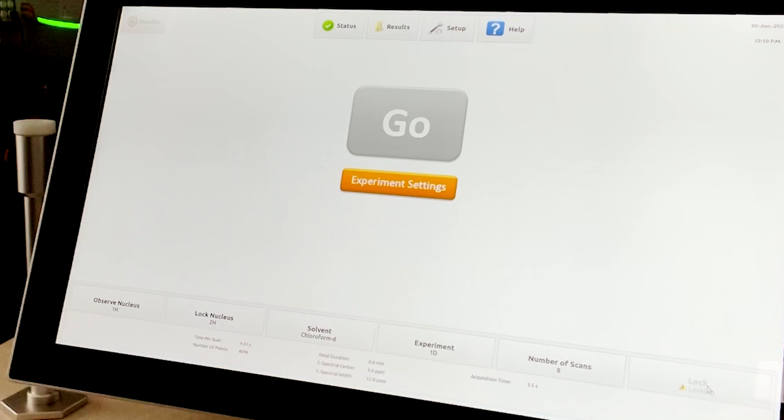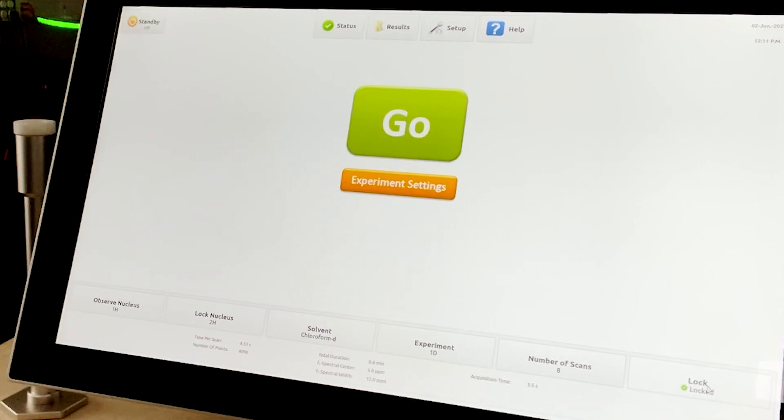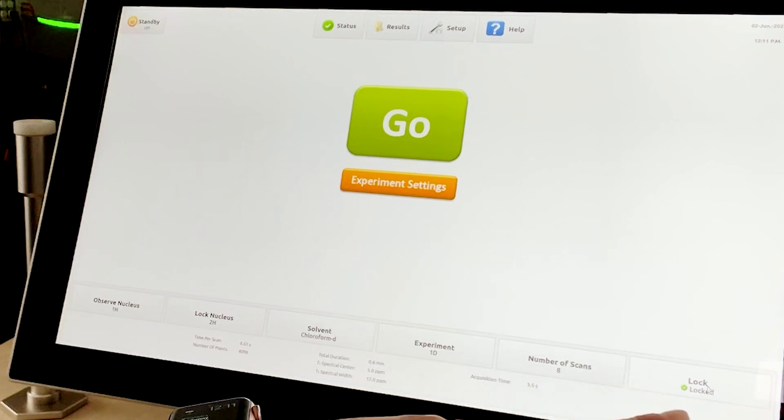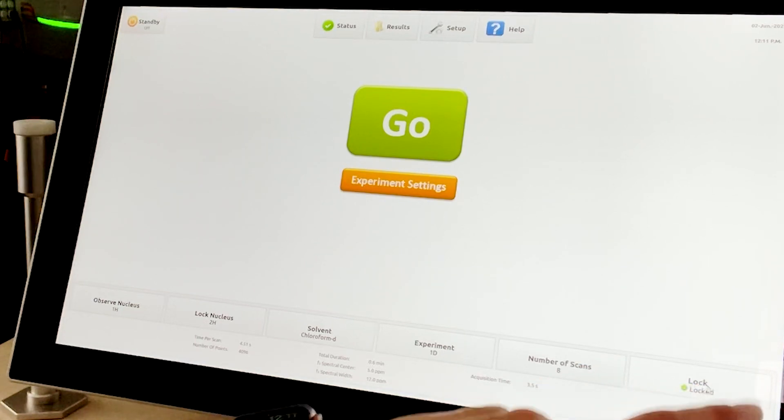The lock was disengaged when the previous sample was removed. When you select the lock button, the software automatically performs a series of frequency, phase, and power optimizations to ensure the instrument is properly locked. While this is taking place, the locking button icon will turn yellow. You will see a status on the button that reads Locking, and then it will turn green and read Locked.